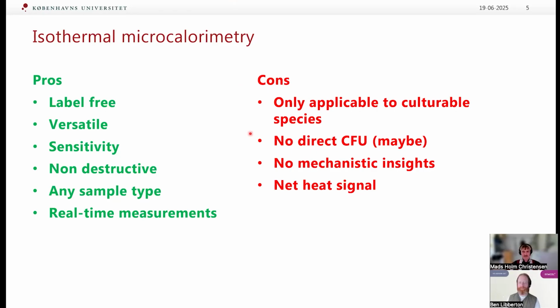But you also don't necessarily do that with standard plate culturing. And then sometimes you can find it a bit difficult to decipher these heat flow curves that you get, because the signal you get is a combined signal of all processes generating heat within your sample. But that could be a pro and a con in some specific cases.